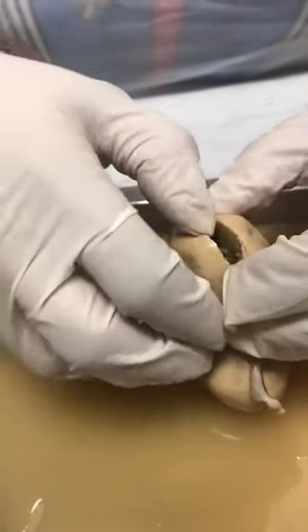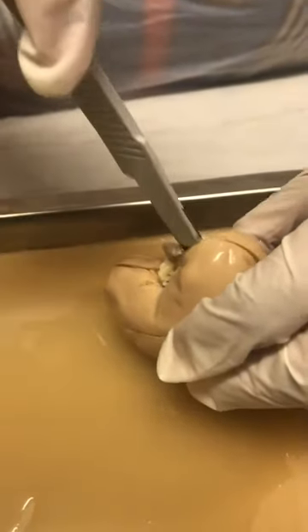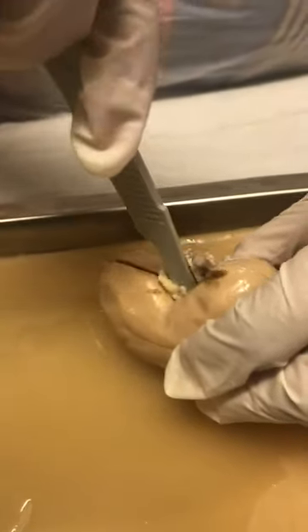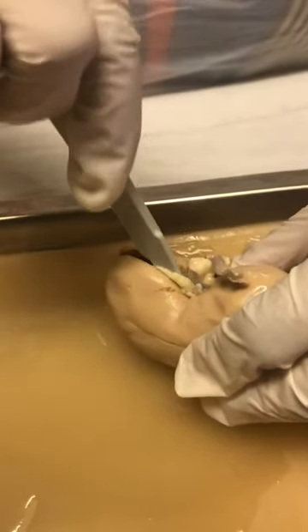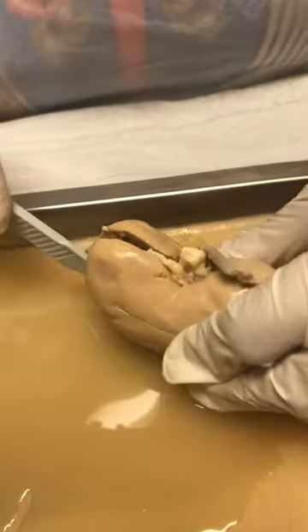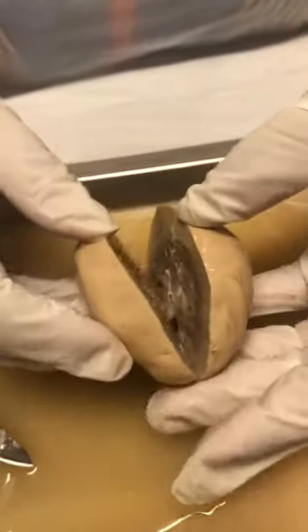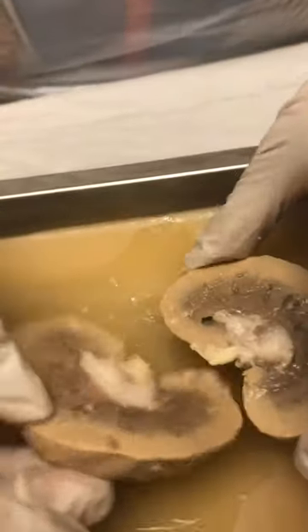Let's see if I can separate it so it's not completely separated. I'm trying not to damage it on the inside so I'll be able to identify stuff. I'm going to divide it in half.